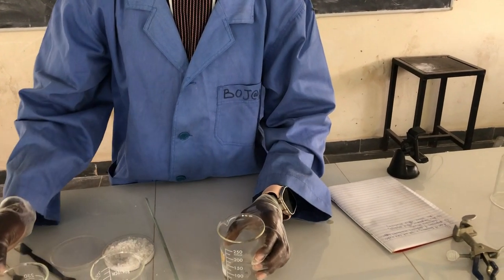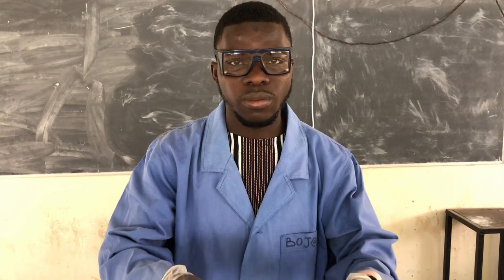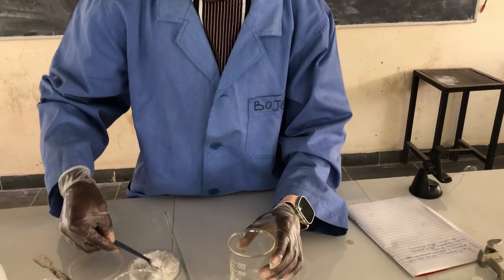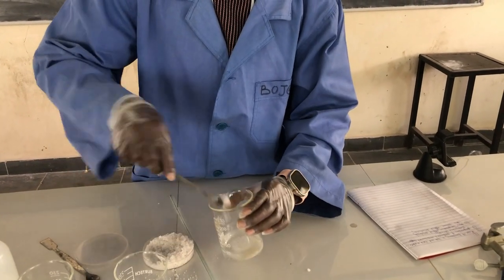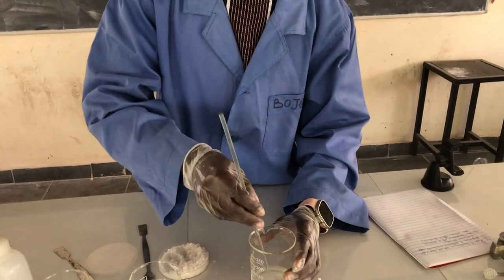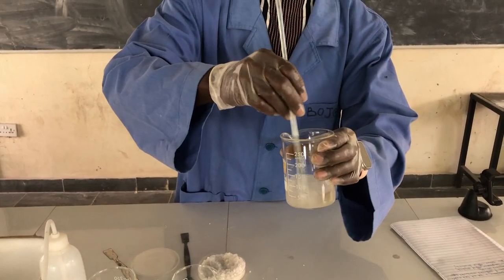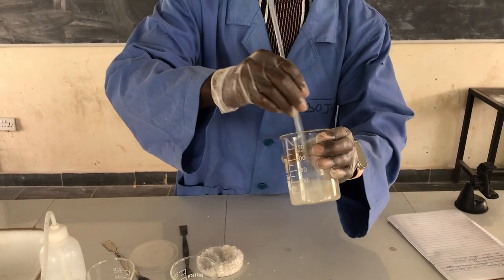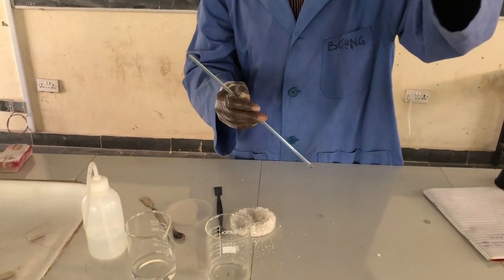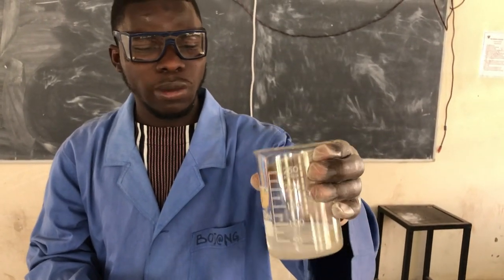The same amount. Now we said in supersaturated solution, it contains more solute than it can dissolve. Now here, it contains more solute than it can dissolve. Supersaturated solution. So this is a supersaturated solution. This is not a true solution.